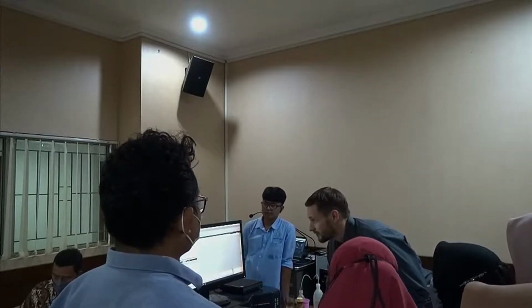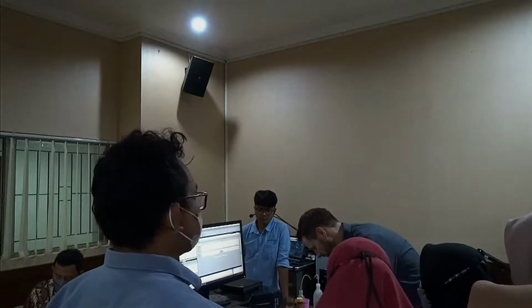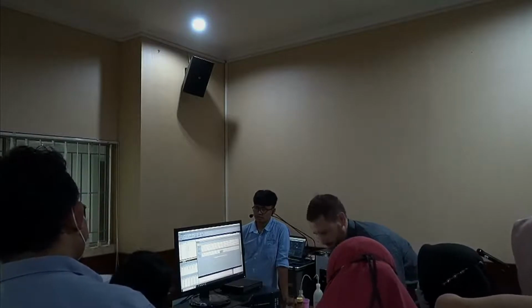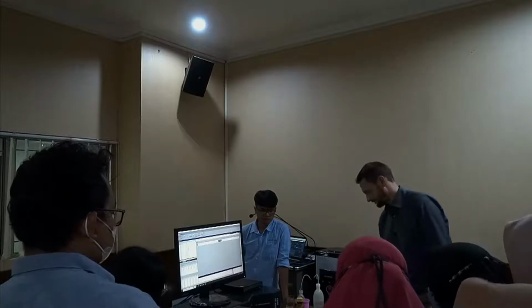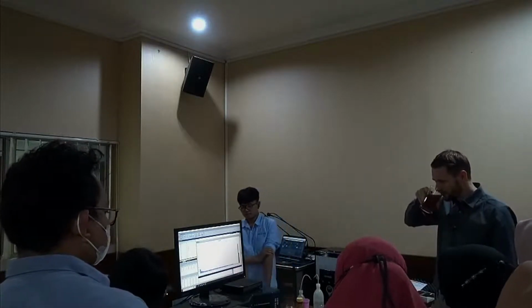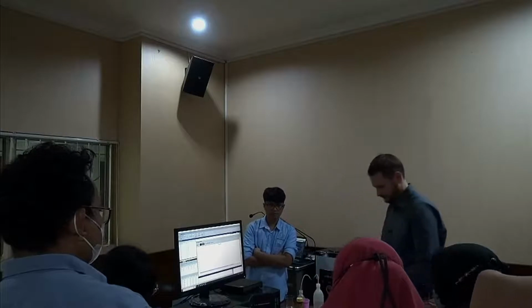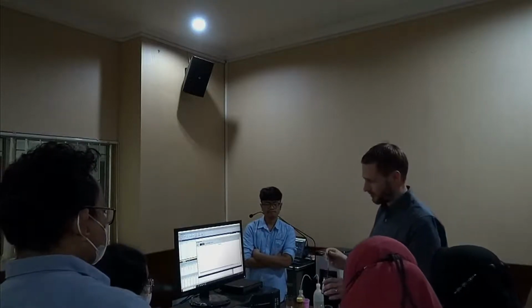So we started, was it FE304? There it is, FE304, yeah. Looks okay, so try again. Of course, as I mentioned, a very disturbing factor is mixing ethanol with water. That's not ideal.